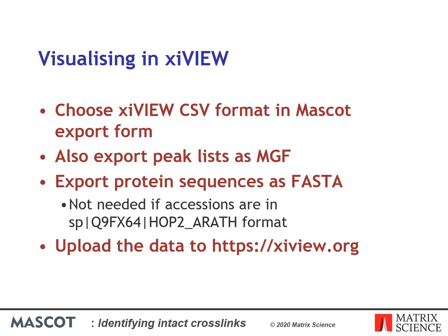xiVIEW can fetch the protein sequences and structural data automatically, but unfortunately the default accession format for SwissProt in Mascot is the AC format, and xiVIEW expects the raw accession. And now upload the files to xiview.org.